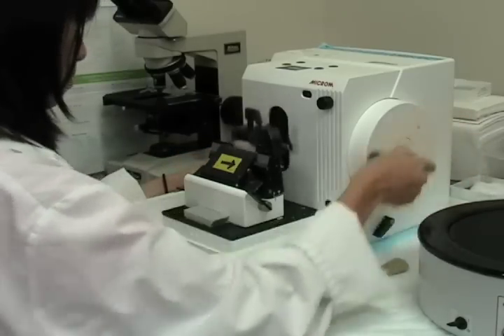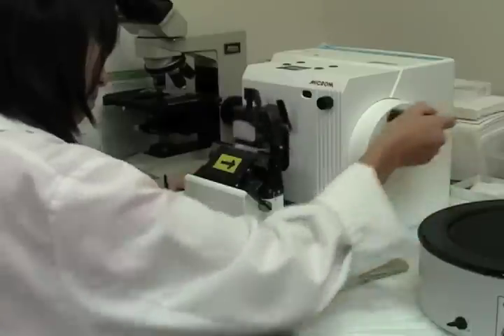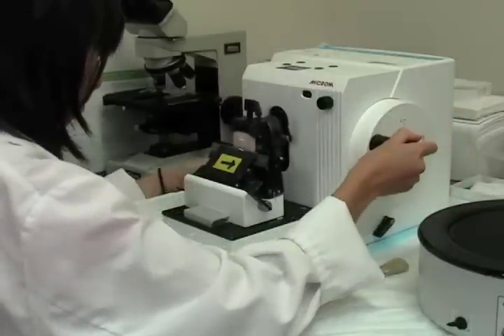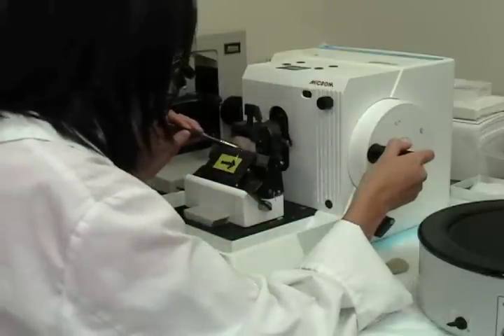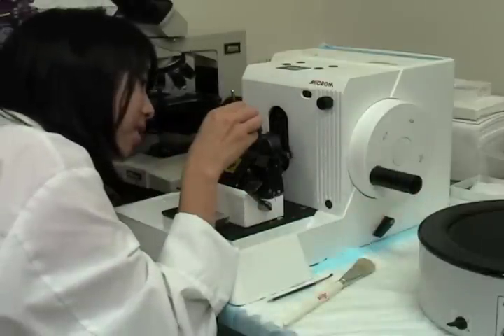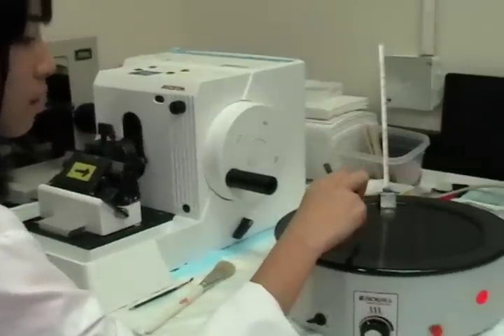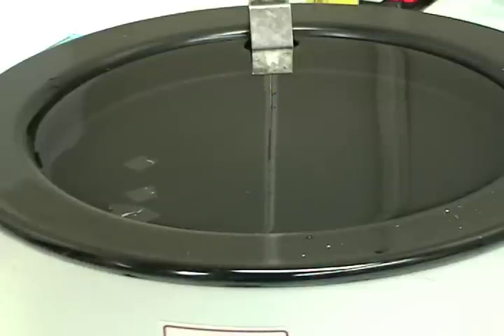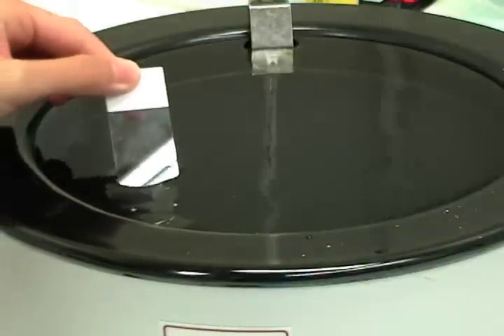Keep on rotating the rotary handle until full sections are being produced. Once full sections or the desired section is produced, you can try lifting it up with a paintbrush or forceps and transport it over to the water. Submerge a microscope slide next to the section and gently pull up. The section should adhere.